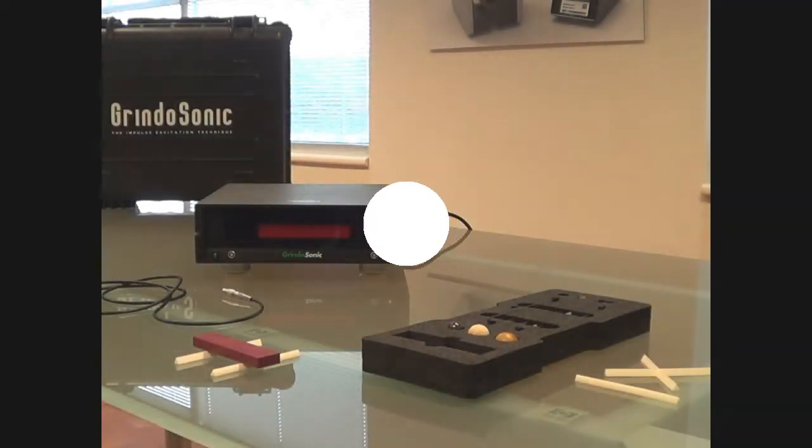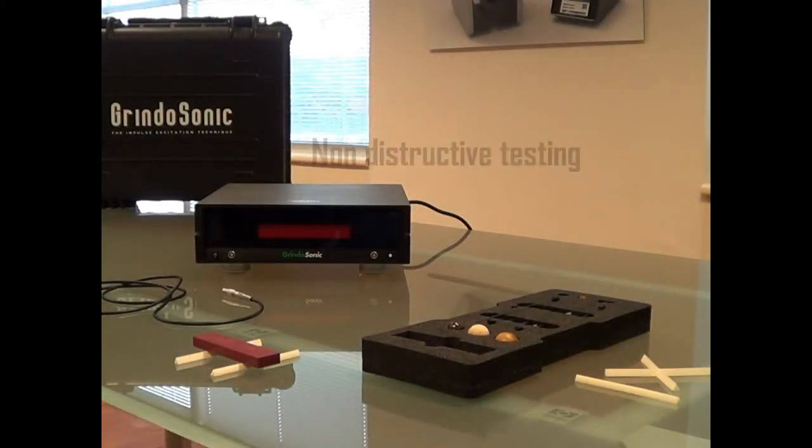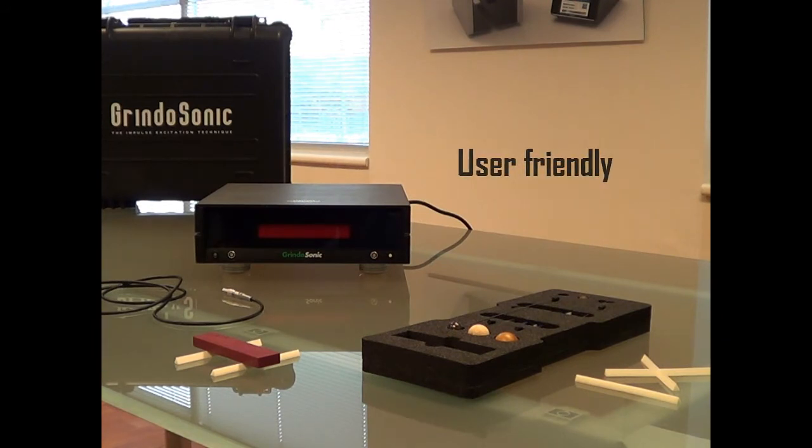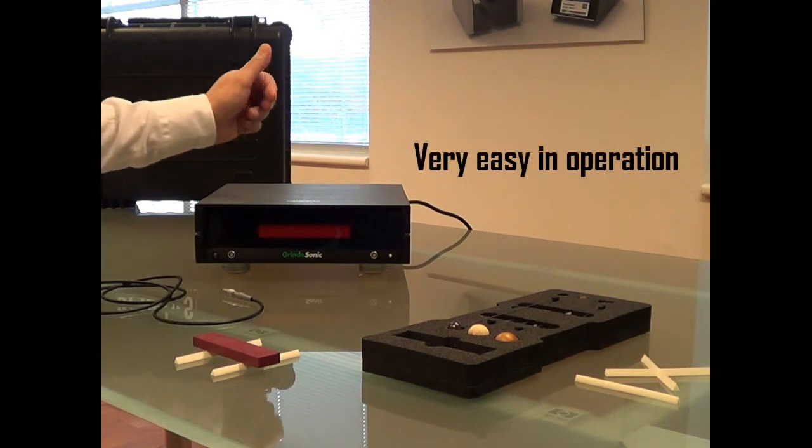We want to introduce you to the GrindoSonic measurement instrument for non-destructive testing. The instrument is a very user-friendly device, very easy in operation.